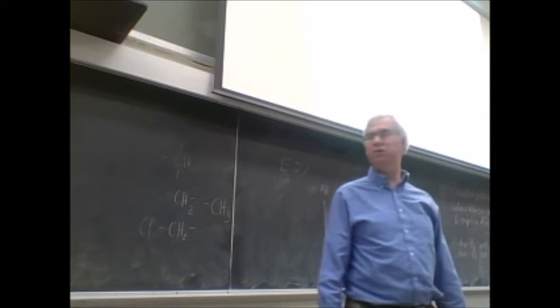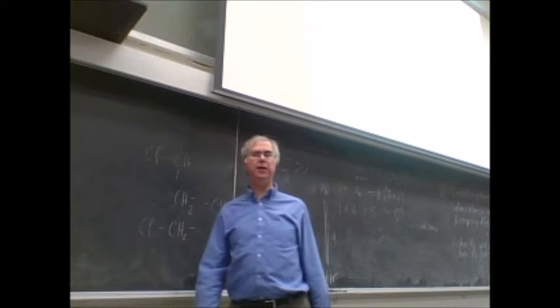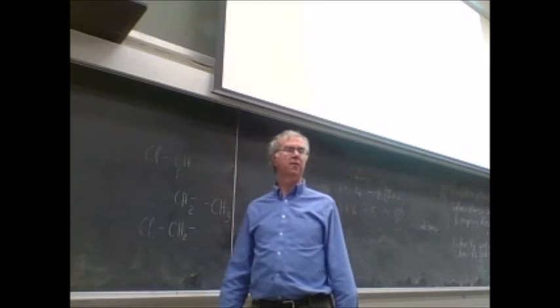What about, where's the other Cl? Is it attached to the CH, the CH2, or the CH3? The CH. Because the other downfield peak at 4.3 is a CH. So we can say we have that peak there. All right.